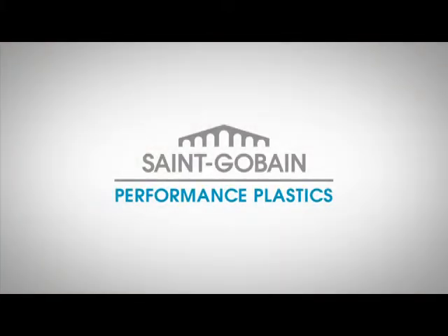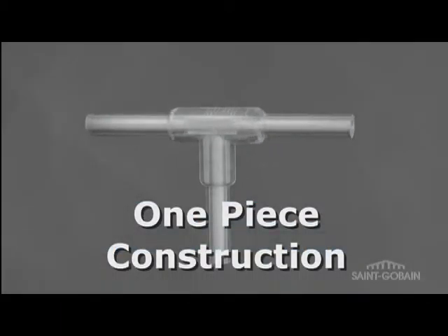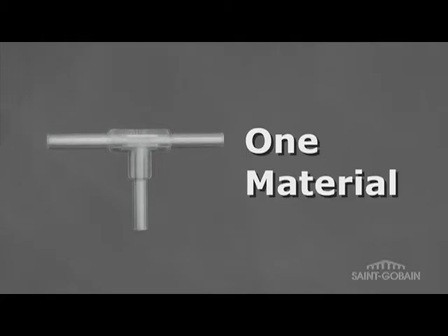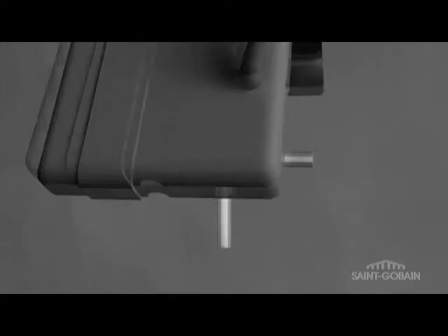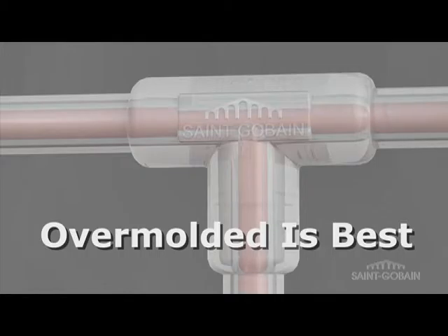Saint-Gobain Performance Plastics has changed all of that with patented SantaLink and BioSimplex overmold technology. This is one-piece construction made from just one type of material. The structure that joins it all together is custom molded from the same type of material as the tubing for the specific assembly configuration. No other bonding materials like glue are used to create the assembly. There is no better way to move fluid from point A to point B with fewer materials of contact than by using overmolded assemblies.